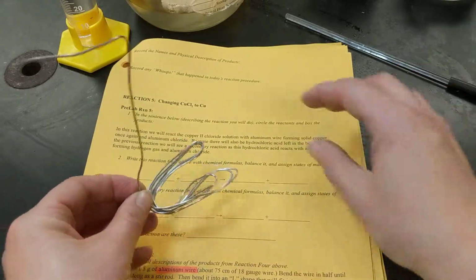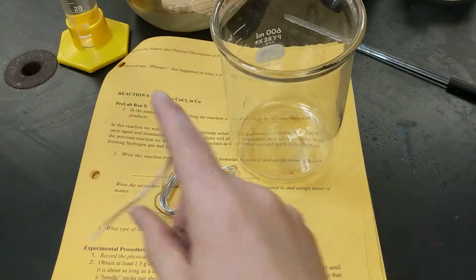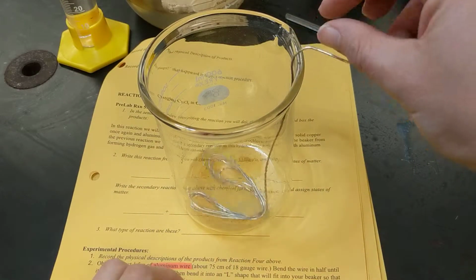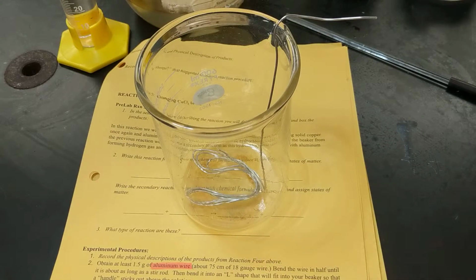So if this was my beaker, I would put my aluminum, and this had my copper in it. I'd stick just my aluminum down inside, then I stick my watch glass on top. Okay, the copper is going to form on the aluminum wire, and I want to dislodge it, so as it's forming, every once in a while I'm going to shake it against the side, and that's going to help the copper fall off. Then we'll let that set overnight, and the following day we will decant off our liquid and then collect our copper.